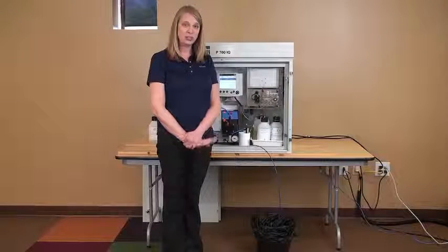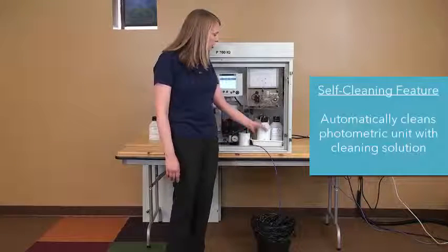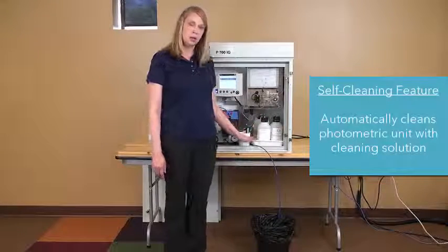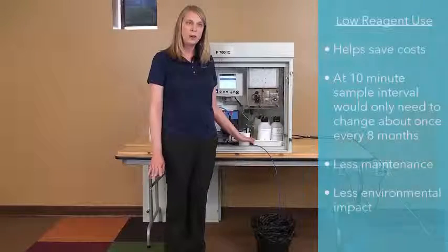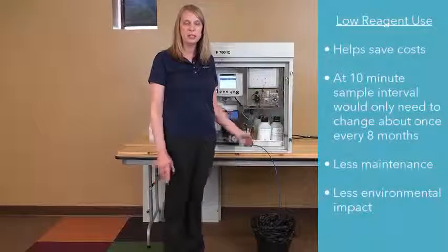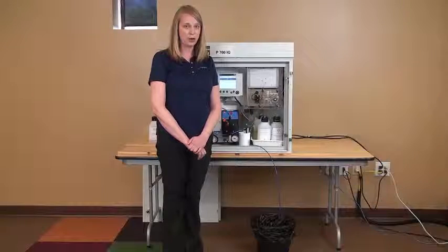In addition to lowering maintenance requirements around calibration, we also have a self-cleaning feature where the photometric unit cleans out periodically on its own with a cleaning solution. And our reagent use is very low — at about a 10-minute sample interval, you would only have to replace our reagents about once every eight months. So a lot less maintenance is required to keep your analyzer up and running.